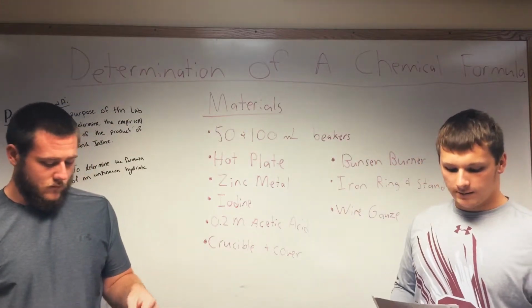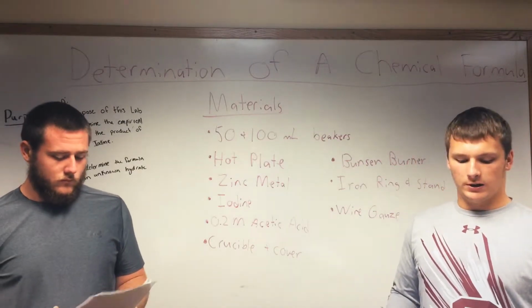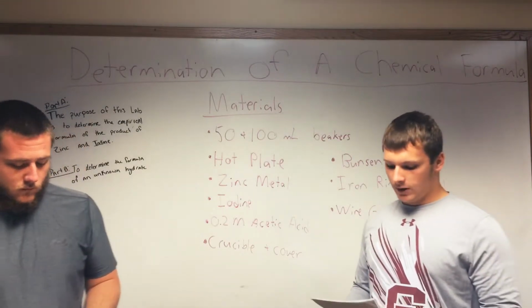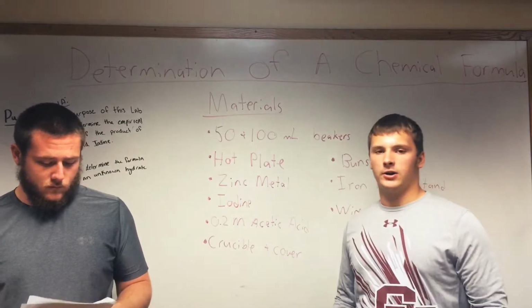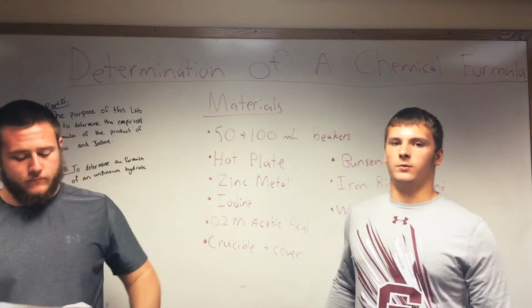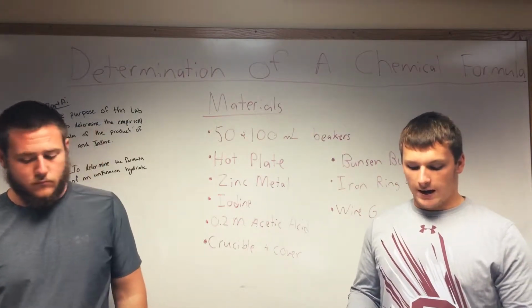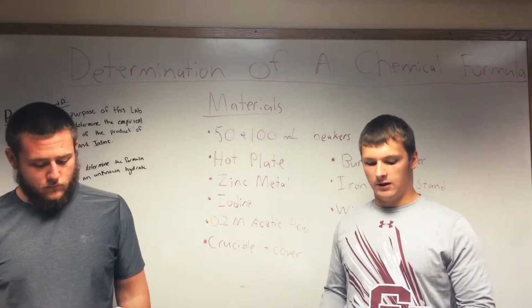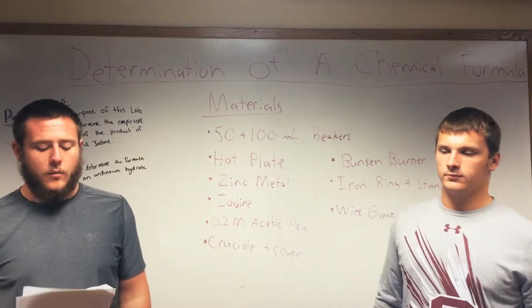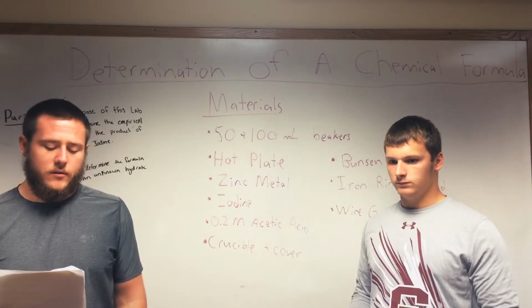To start Part B, we had to find the mass of an unknown hydrate that we were given at the beginning of the lab period. We then had to heat gently for 5 minutes. If we heard any crackling or popping, then we had to take it off and wait till that sound stopped, then put it back on. After 5 minutes, we had to turn the heat up and wait another 20 minutes to heat it all up. Once the 20 minutes was over, we let it cool and then we recorded its mass.